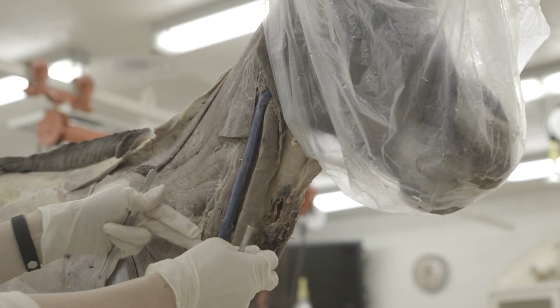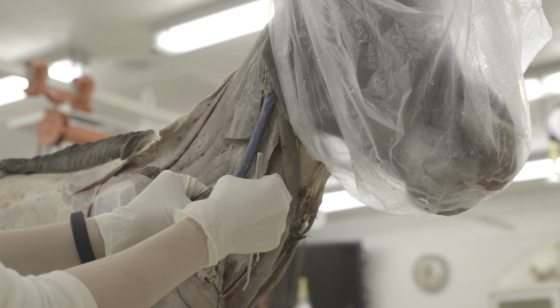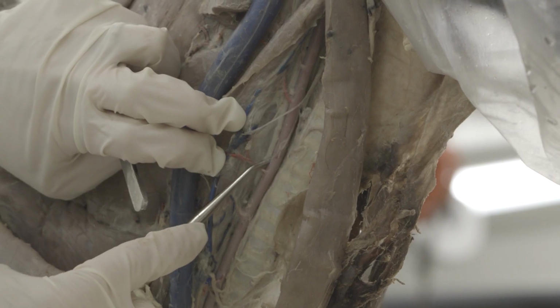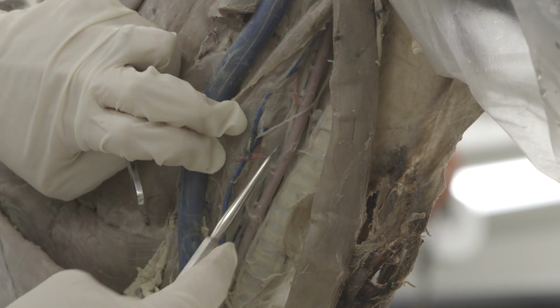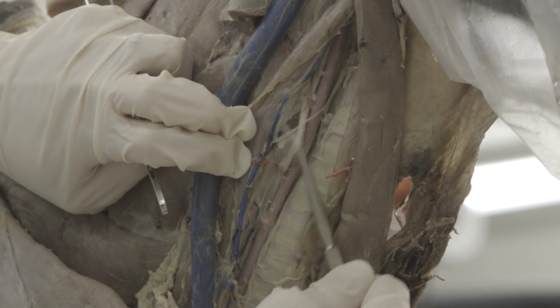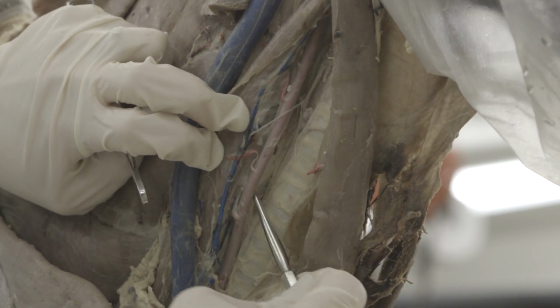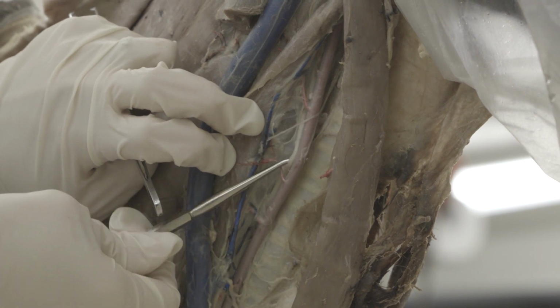Then we also have, underneath your omohyoideus muscle, you want to identify your carotid sheath, and the carotid sheath is the fascia surrounding your carotid artery. So you have right common carotid artery here, and then you have vagosympathetic nerve trunk on the right side, right alongside it. And this fascia that surrounds it, I have a little more fascia left on this side, is the carotid sheath. So it'd be all that fascia surrounding the carotid artery and vagosympathetic nerve trunk.